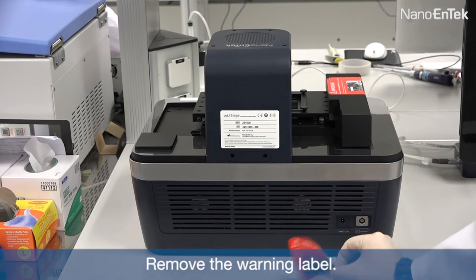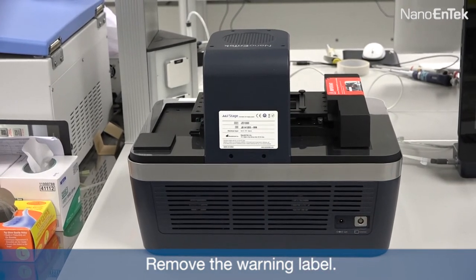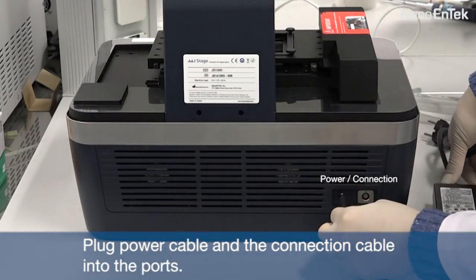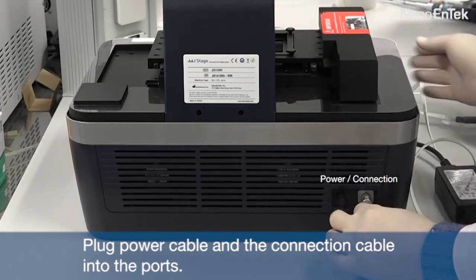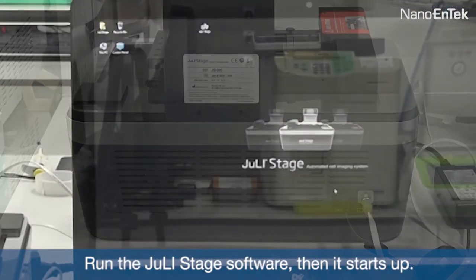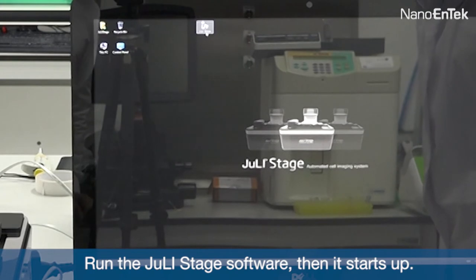Remove the warning label. Plug the power cable and the connection cable into the ports. Run the JuliStage software and wait for it to start up.